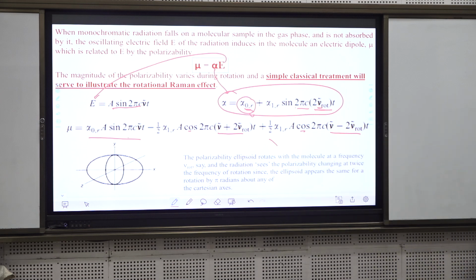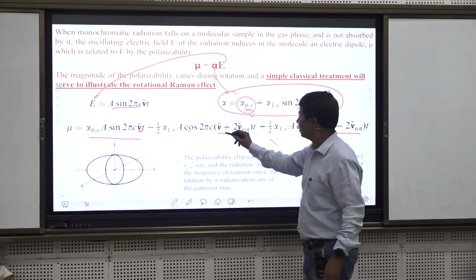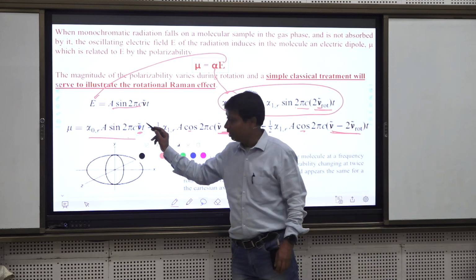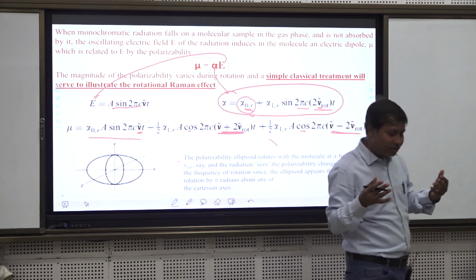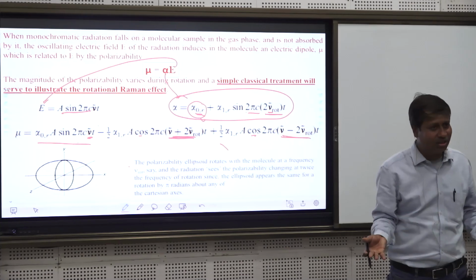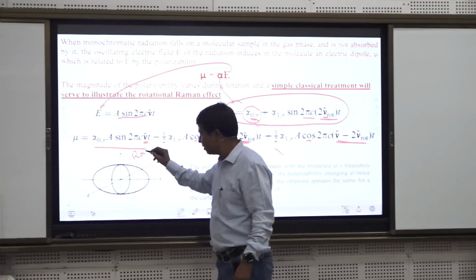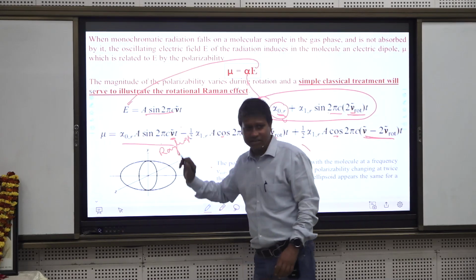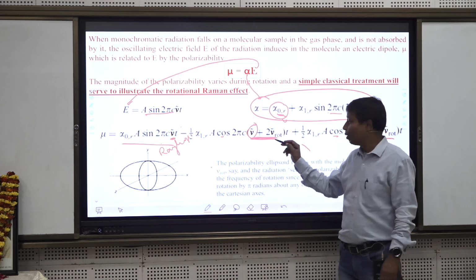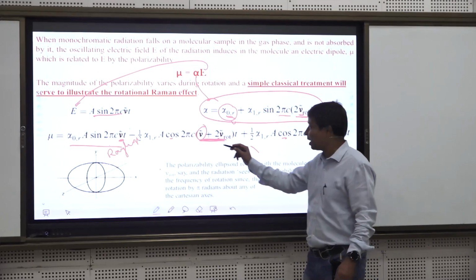How many scattered radiations will we see? So this frequency is here, and this one, so this is nu t. What is nu? Nu is the frequency of the light. So one radiation you will see where there is no change in the frequency of light, and that is known as Rayleigh scattering.